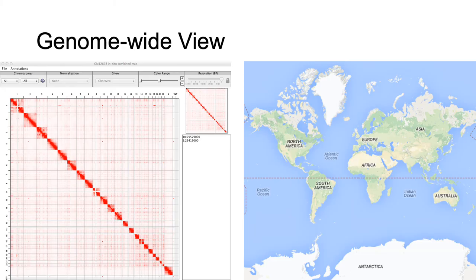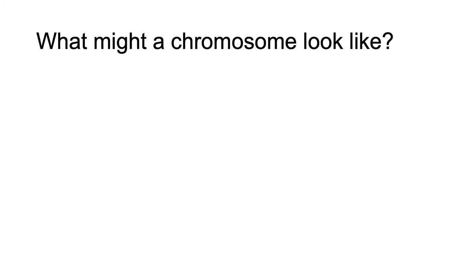So, at genome-wide view, you would see chromosomes, the equivalent to continents in this metaphor. Even at this scale, you can see interesting patterns. For example, what might a chromosome look like in a heat map?